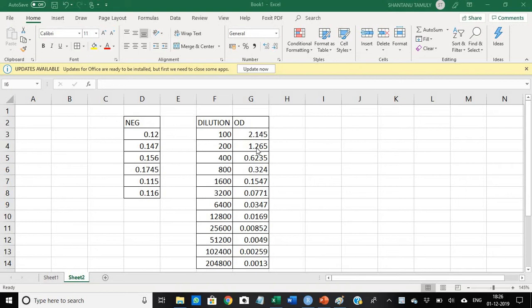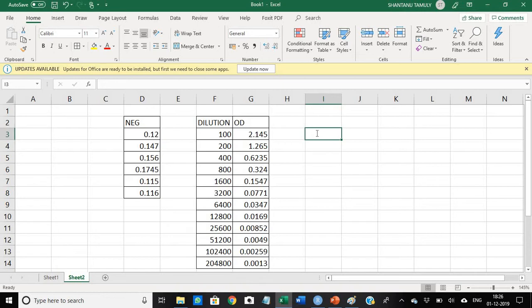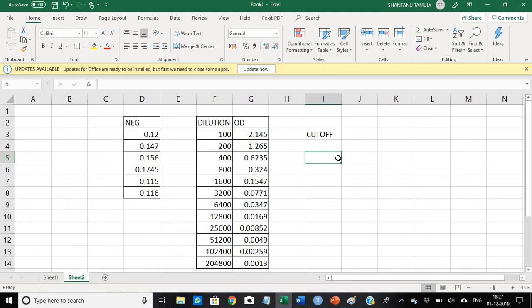I've done the indirect ELISA and this is the dilution of the serum: 1 is to 200, 1 is to 400, like that. Now first of all, we are required to find out what is the cutoff value. So cutoff value we will determine using the software that is called R Studio.